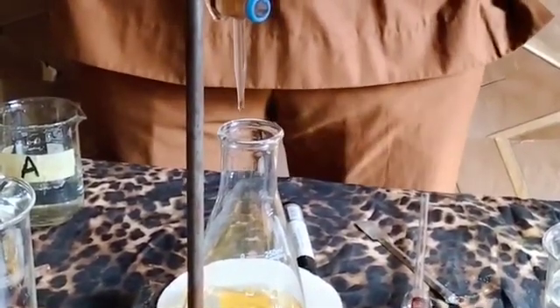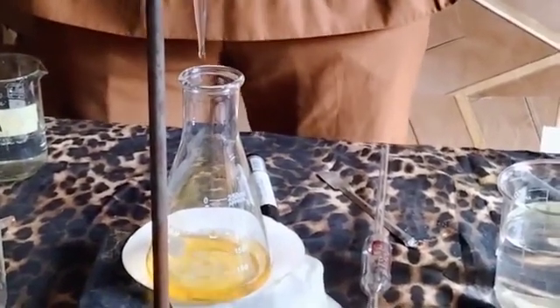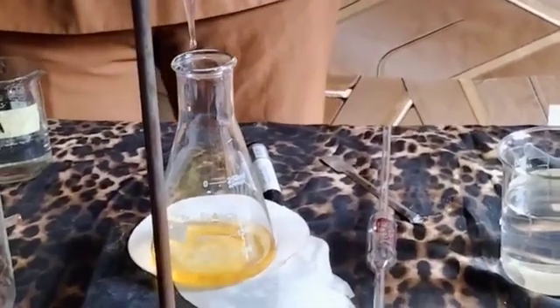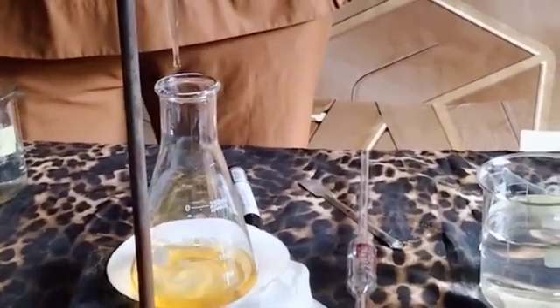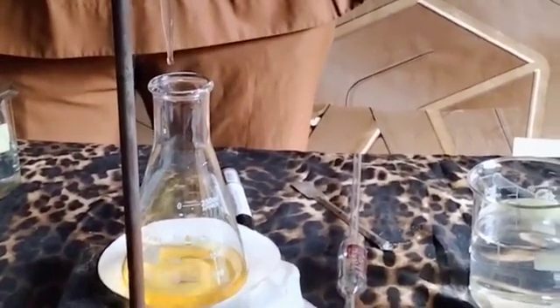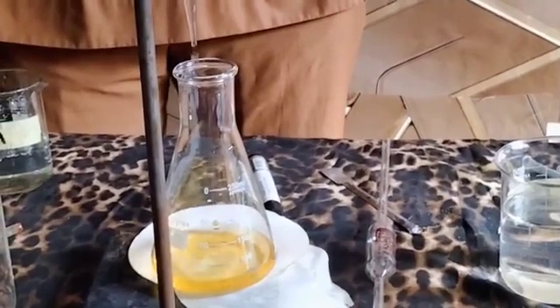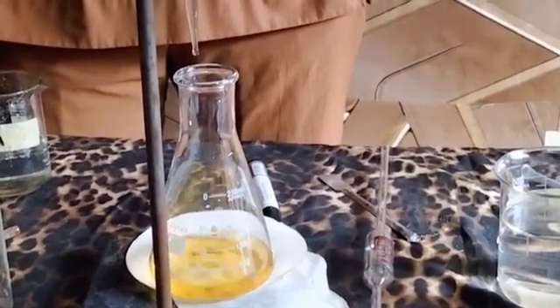So I'm looking at the white tile, observing the color change. You're going step by step. So doing the first one will give you an idea of the end point. So you allow the first one you're doing to go little by little. So when you do the second one, you can now increase your pace or increase your speed. So that is it. Make sure that the tap is not leaking. That's what are the precautions.